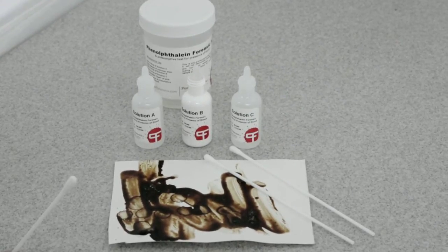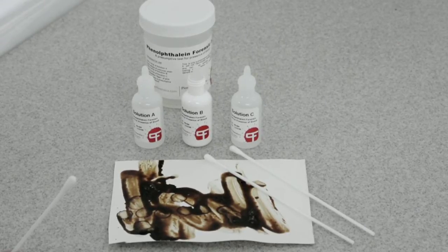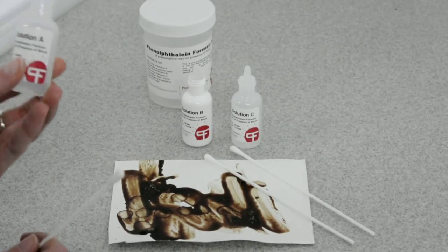This is the phenolphthalein presumptive test for blood. We're going to be using the Pioneer Forensics Phenolphthalein Kit. It contains three solutions: a hydrating solution, labeled as Solution A.